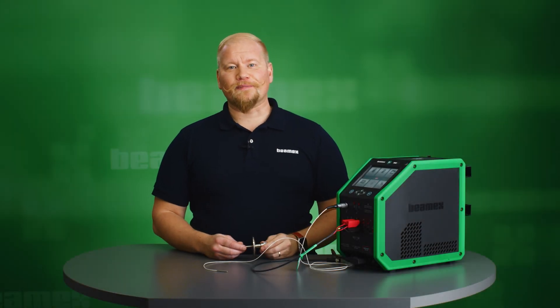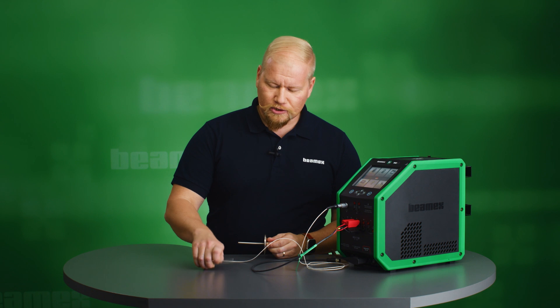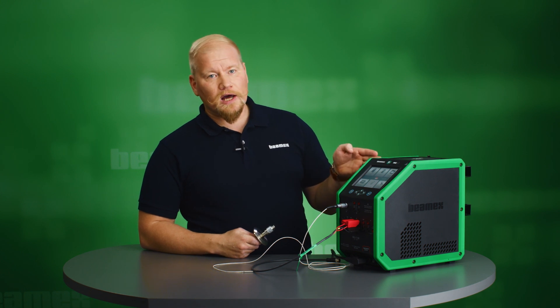Hi, I'm Sebastian from Beamex. I'll show you how to calibrate a short sanitary sensor. To do so, I will also be using a dedicated short reference sensor, and for the heat source I will be using the MC6T150.